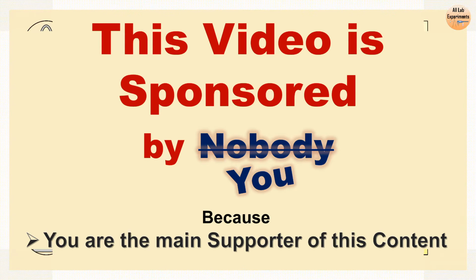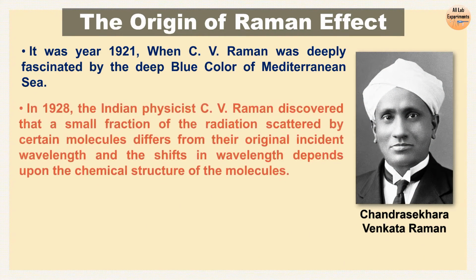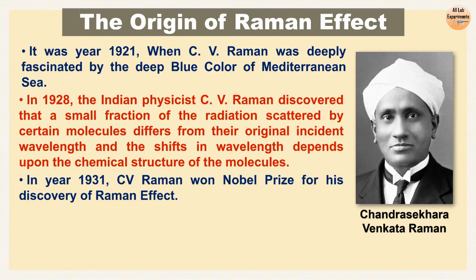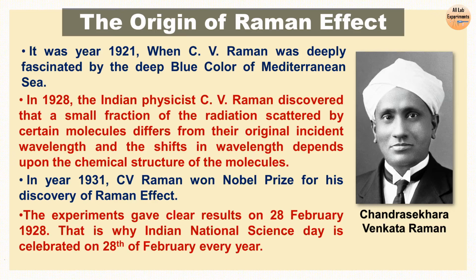So let's move forward. Raman spectroscopy was discovered by Chandrasekhar Venkat Raman, an Indian scientist. He saw the blue color of the Mediterranean Sea and was curious about why this color is blue. That curiosity led to the discovery of the Raman effect, which is one of the prominent characterization techniques in material science nowadays. So let's discuss the origin of the Raman effect.